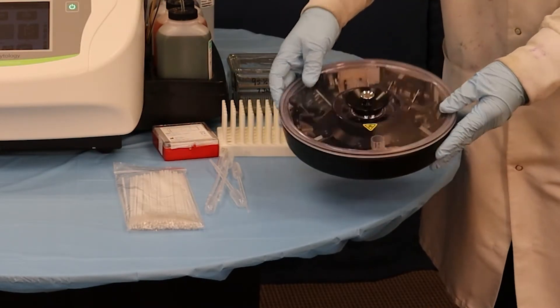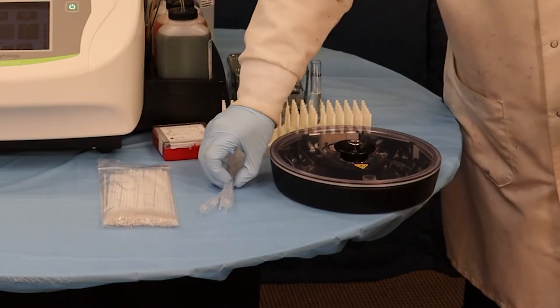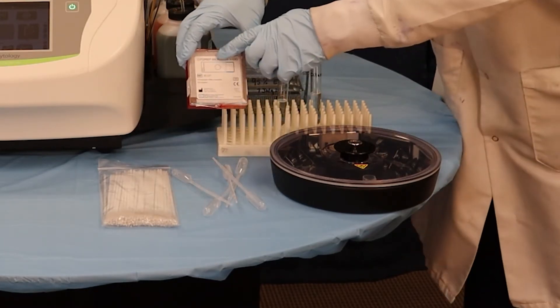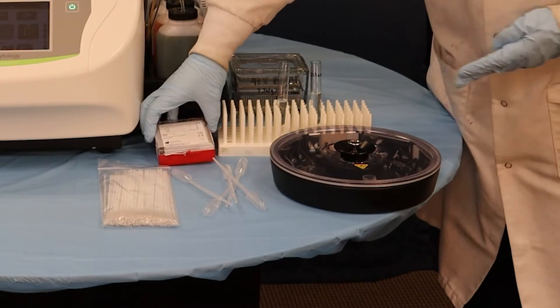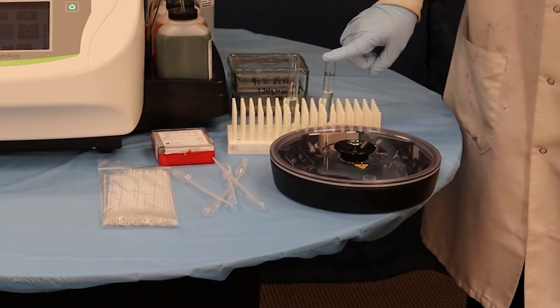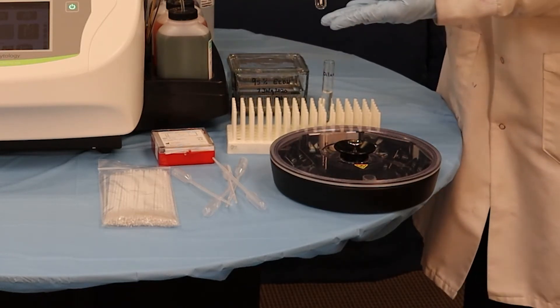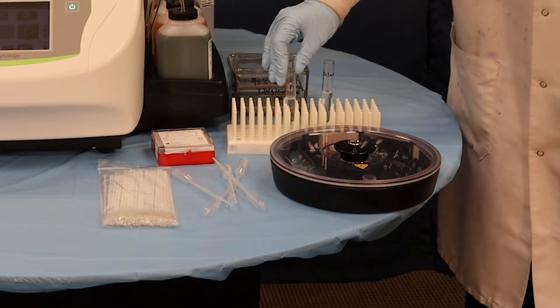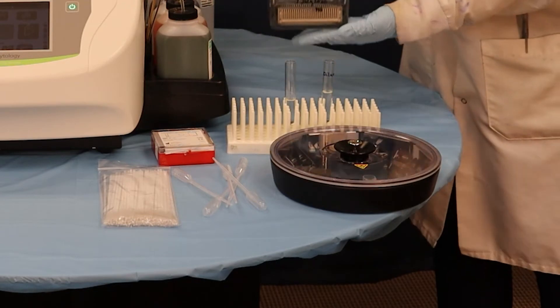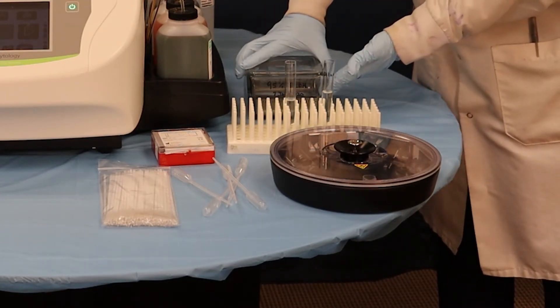This is our Cytopro Rotor. We'll be using these brushes here, as well as these disposable pipettes. We have our slides with the circles on them so we can identify where the cells will be located. I have my diluent here, which is a saline solution, and also saline solution in this tube that will be used to suspend the cells before mounting. After we're done we'll be putting them into a 95% ethanol solution before staining.